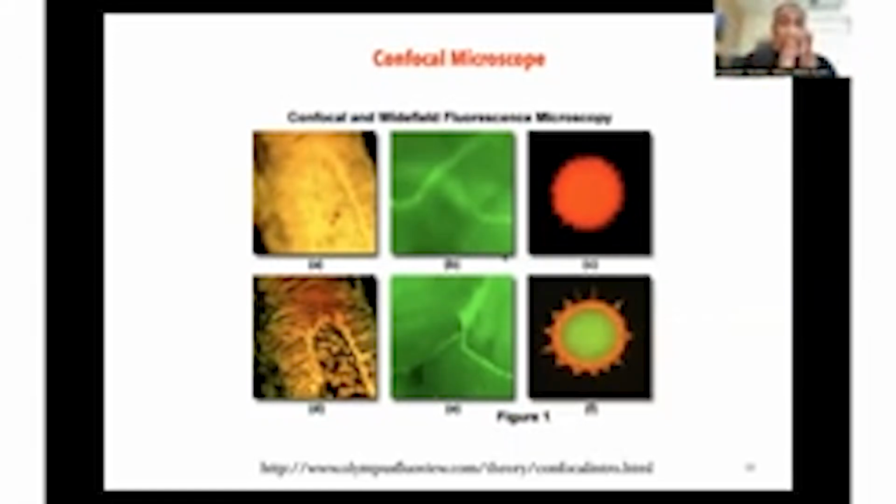The other really major advance, so you had the conventional microscopy, you had the ability to now use these objectives to see cells in such a way that you could not before. You had fluorescence microscopy, where you could tag certain things with a fluorophore and now look at that fluorophore inside the cell, or that fluorescent molecule inside the cell rather than just the cell. The other real major advance that happened with microscopy is something called confocal microscopy.